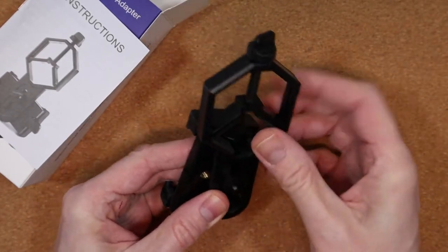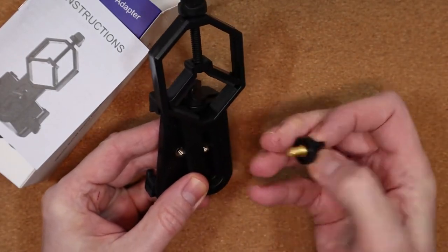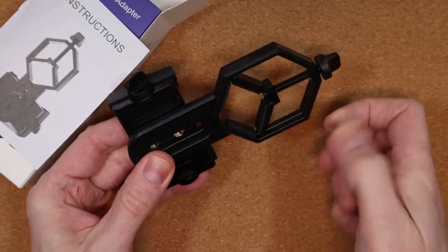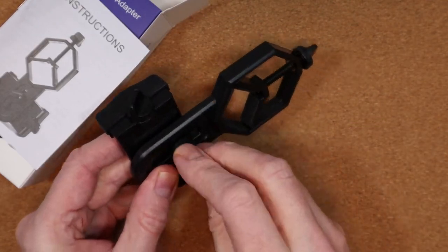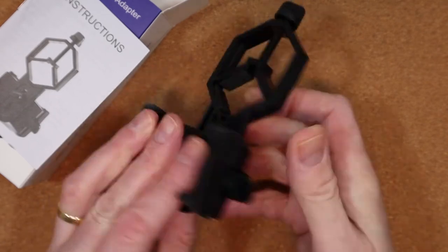There are three dials on it, one to adjust the width of the clamp to suit your phone, one to secure it to the eyepiece and one at the back to adjust the position of the phone so that its lens is in line with the eyepiece.